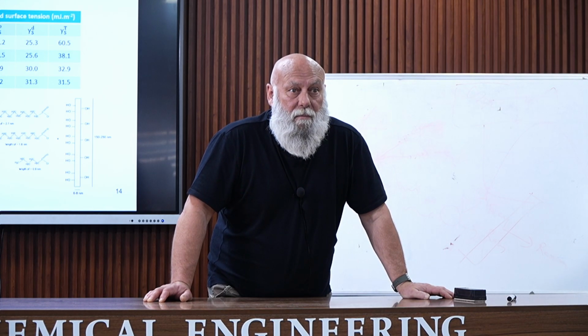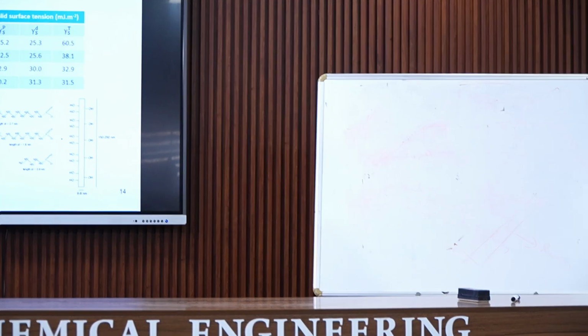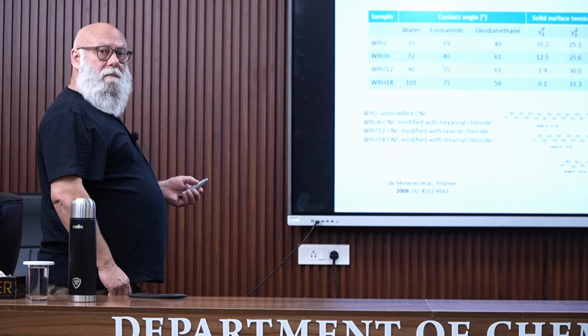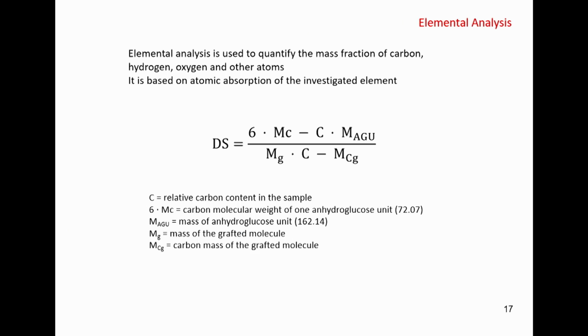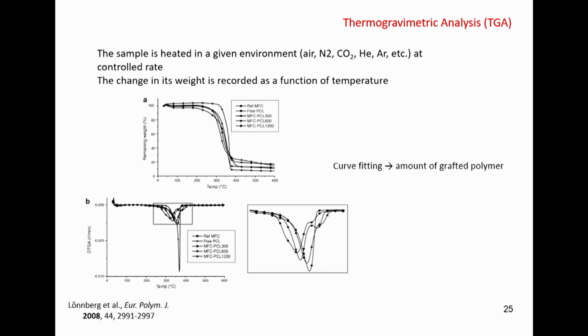The thing which you said is residue. Residue, yes. After the degradation, I don't know if we see here in the curves that I showed. After the degradation process, I think it was before or after, I don't remember. No, it was after. Yes. You see, after the degradation, this weight corresponds to what is called the residue. And so it can also give some information on the material, on the degradation of the material.